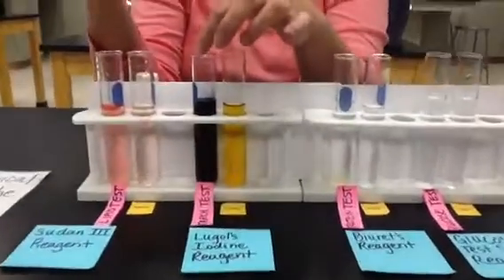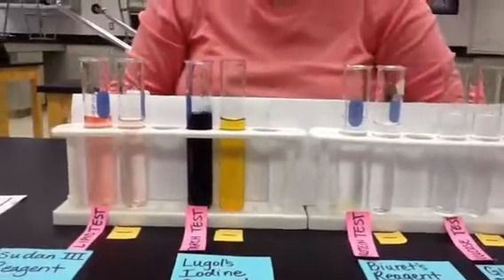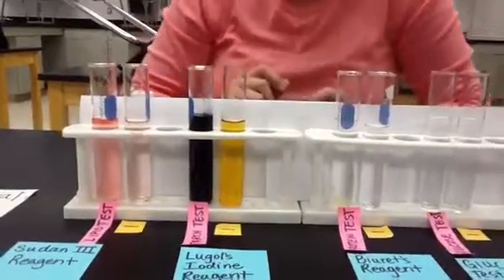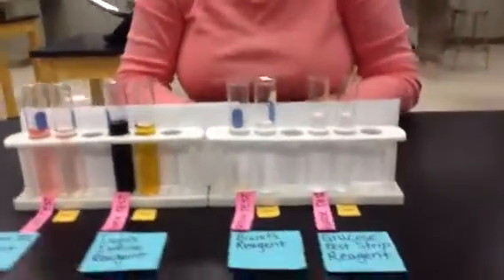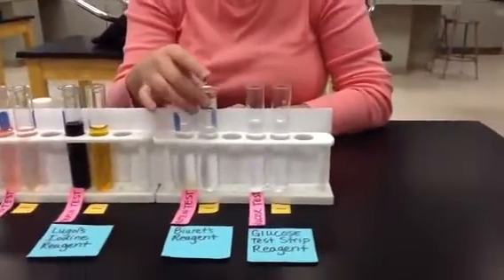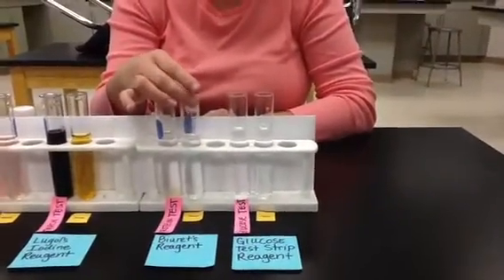This is a positive test for starch, and a negative test for starch. This means there's no starch in this using Lugol's. The next one we're going to use is Biuret's. Biuret's is a reagent that we're going to use for the test for the presence of protein.